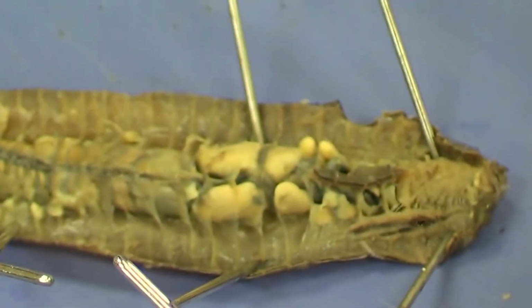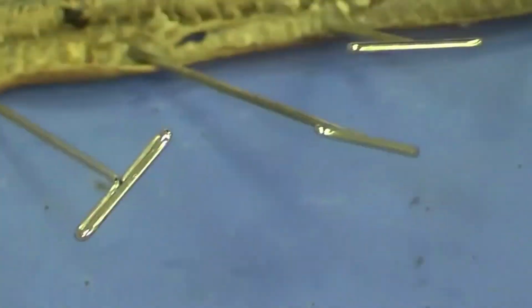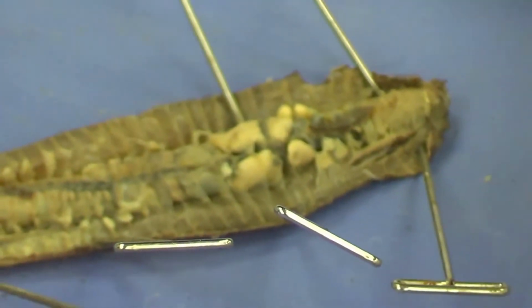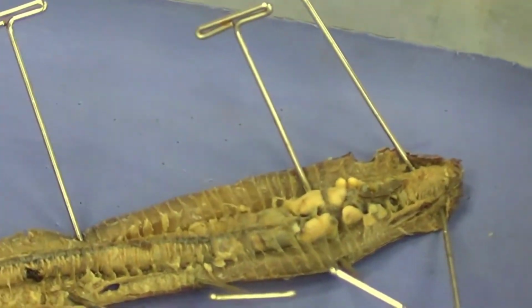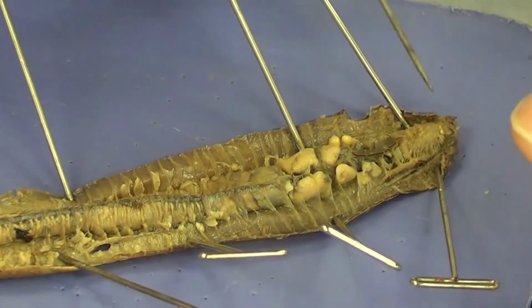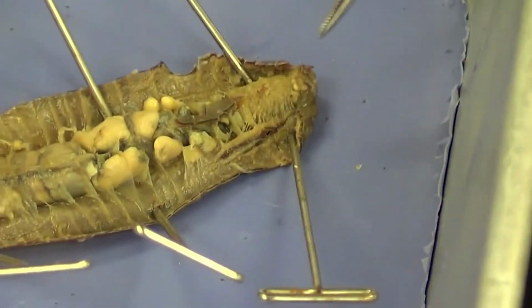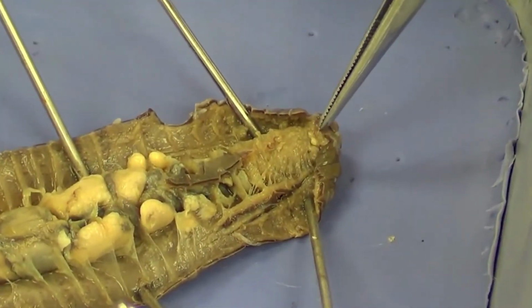And there we are. We've dissected our earthworm, and now all that remains to do is to go over some of the anatomical parts. And the first thing I want to show you here, in case it gets destroyed, you can see these white structures right here. I'm going to try to hold this down just a little bit. Maybe we can get a close-up shot of this.